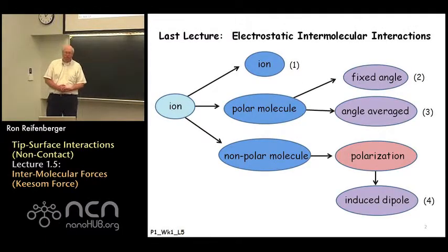So the last lecture, we discussed four interaction forces. The diagram here indicates those four interaction potential energies that we actually discussed. I'm starting to label the cases now because we're starting to get a significant number of these cases, and so the number associated with each bubble should allow you to go back and find the relevant slides, which are also numbered accordingly to match this diagram. So cases 1, 2, 3, and 4 were discussed in the previous lecture.